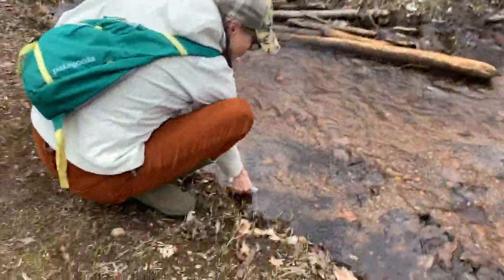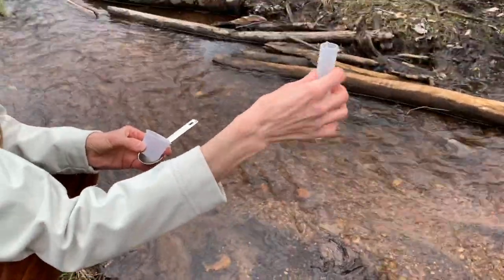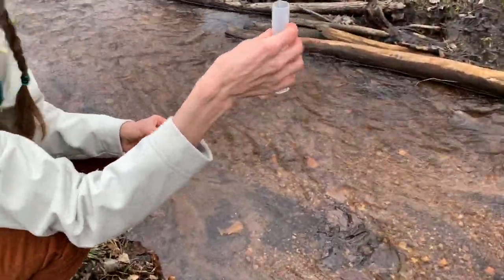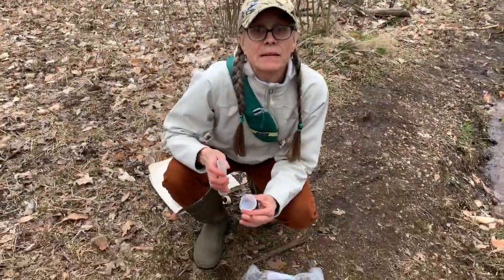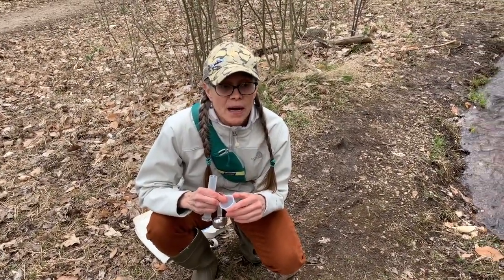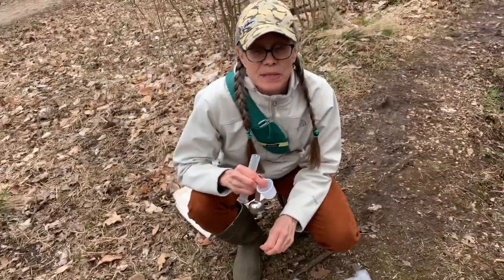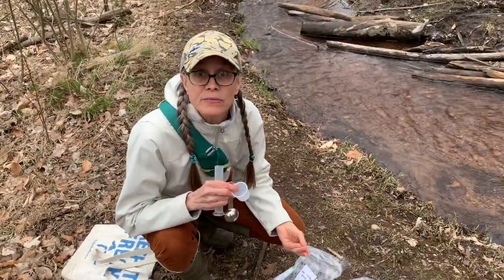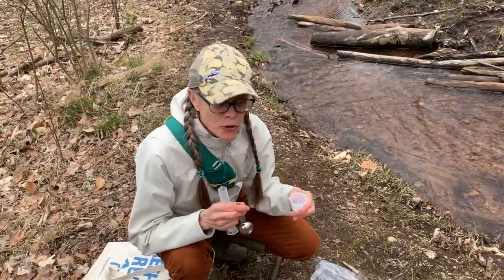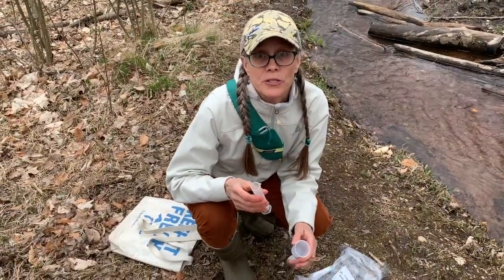So what I want to show you is that when I grab 10 milliliters of water with my graduated cylinder, and I'm using the creek water, which you may or may not have access to a body of surface water at home. And if you don't, I recommend that if you're going to use tap water, that you let your tap water sit out for 24 hours without any lid on it, so that some of the chemicals that might be added to the tap water can evaporate or gas out of the water before you add it to your samples, okay? So we want to try to get a fresh sample of water to put in there.